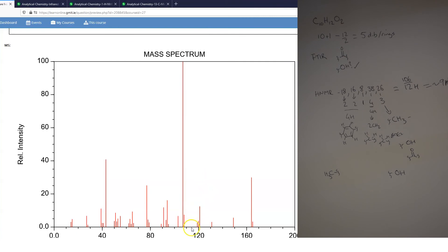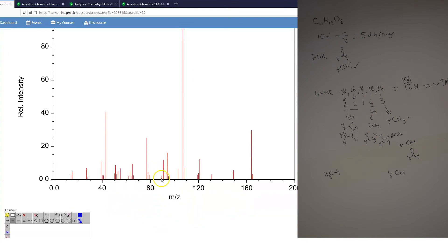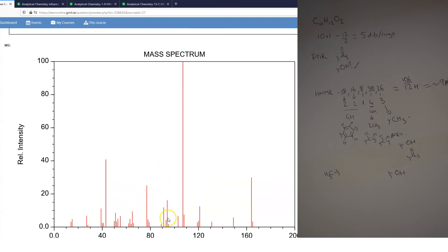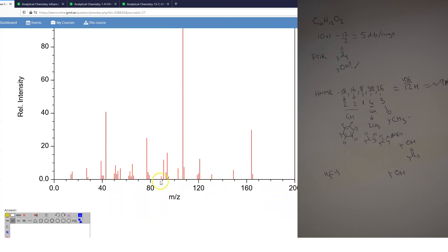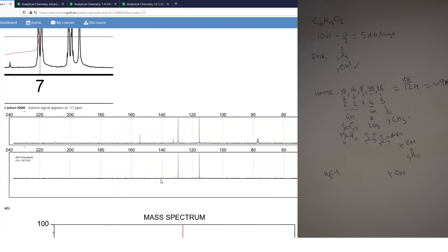From the mass spectrum, we can see a fragment at 43, which would correspond to a terminating methyl ketone. We can also see a small peak at 91 but no major peak at 91, meaning it's unlikely that there's a methyl group directly attached to the aromatic ring. This informs our structure. Let's go back to the NMR to substantiate further.